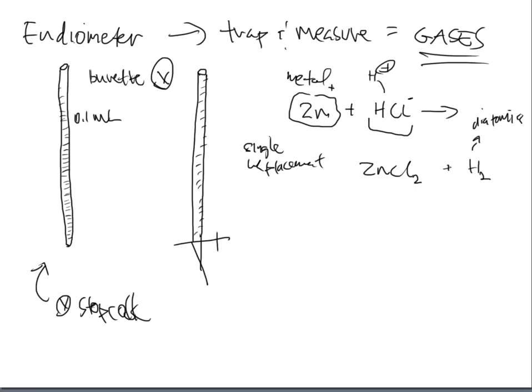But the most important piece, and how this relates to our actual laboratory topic, is that one of these products is the H2. And if I take a look at H2, what I'll realize is that this H2 is hydrogen gas. That's how this is going to relate.